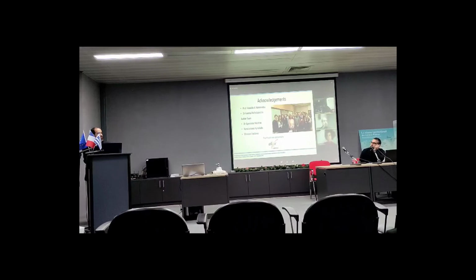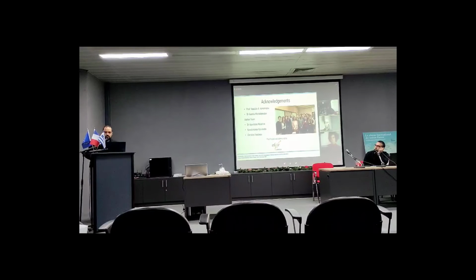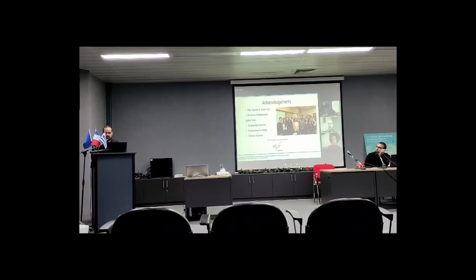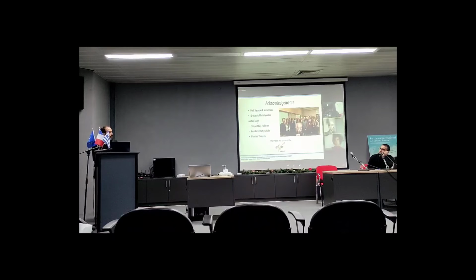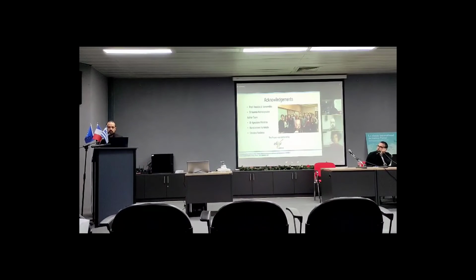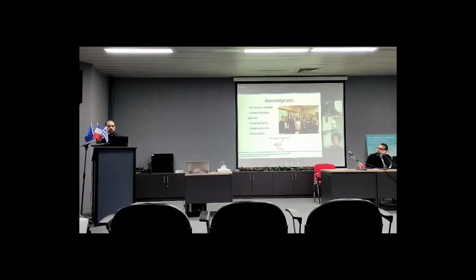Now, on the other hand, if we really wanted to split the data set, that means we do not currently have any disease data, but let's say we have disease data, right? That would produce a really confounding result because you would mix a lot of diseases together.